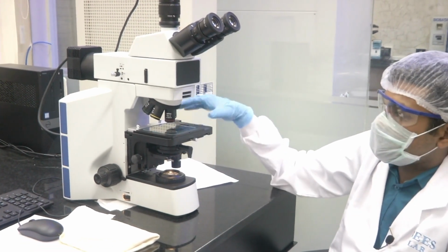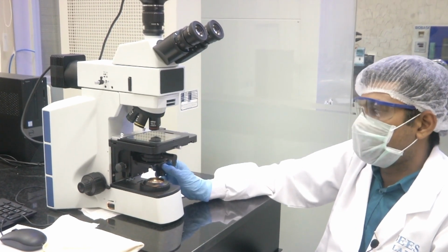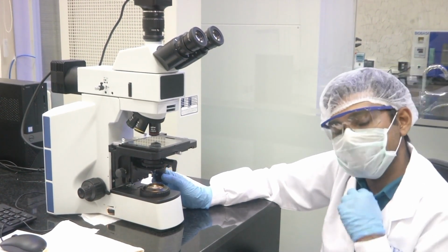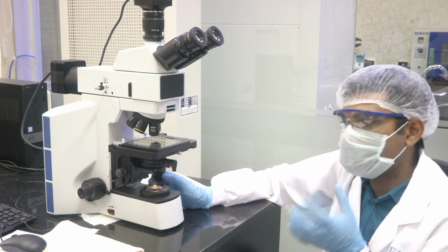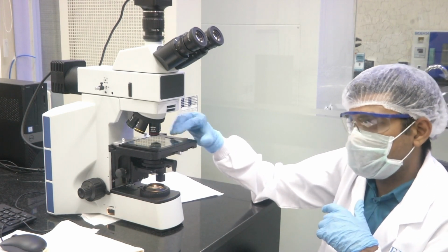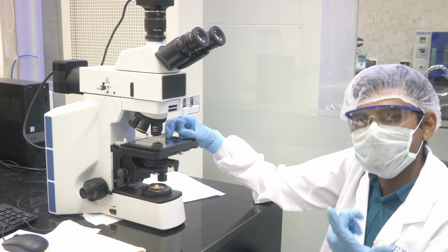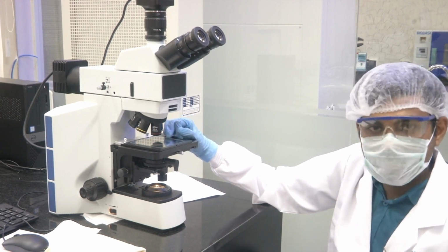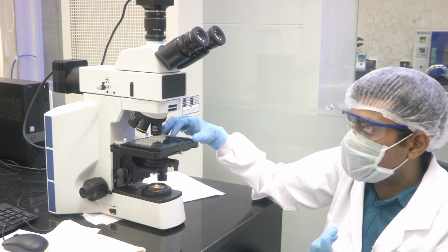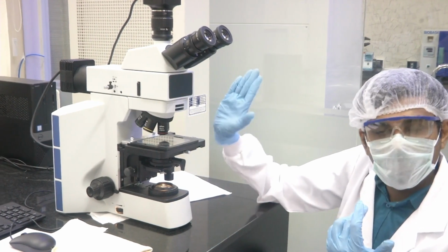Same as what we saw before, we have a sample holder here, but this sample holder is slightly more complex. It is engineered and machined for fine adjustments. There is a transparent platform. If your sample is transparent, like a glass slide or a petri dish or a tissue culture dish, you can keep it on top of this and the bottom illumination can pass through your sample.